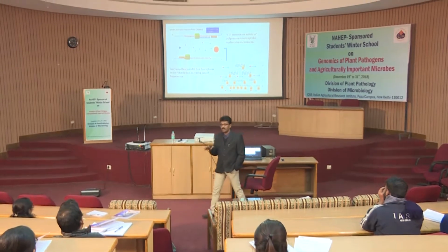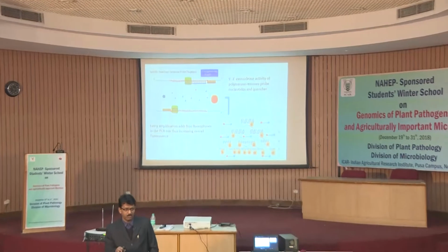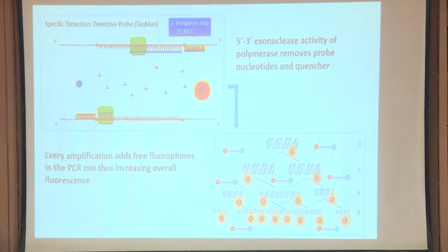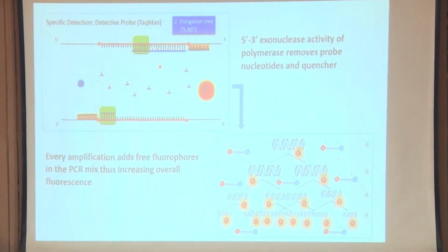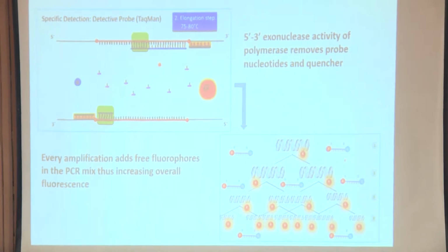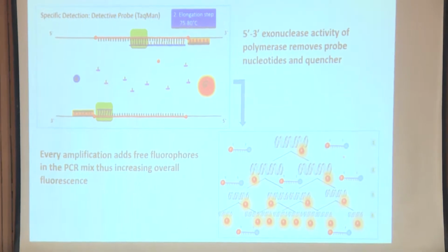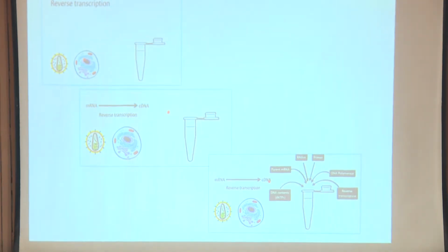My point here is just to throw some light on real-time PCR, so that you understand the basic concepts of the two different real-time PCR techniques which are ruling biology now, more so the dye-based one. Okay, that is the primary focus of my lecture today. And in practical, we will clarify whatever doubts you have, how to analyze the data for absolute quantitation, and how to analyze the data for relative quantitation. All of those we will do in the practical class. Okay. If these two concepts are clear to all of you, just move on to a few more points.